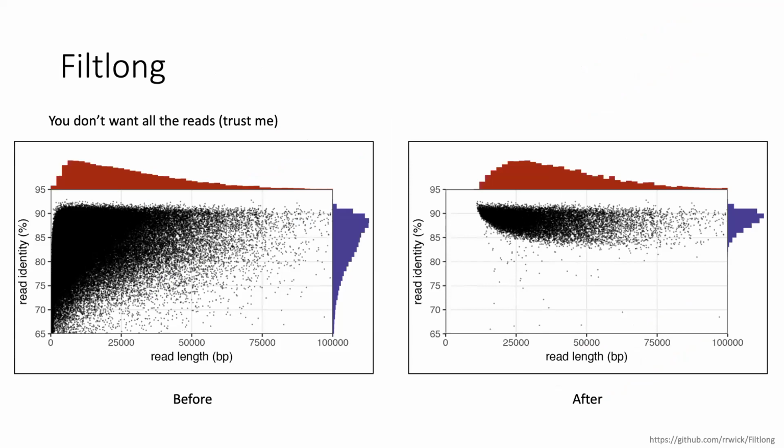So this is a tool, it's called Filtlong. There are many other tools out there, but Filtlong is really easy to use. And I'm going to walk through this graph. The left graph is before Filtlong. You can see it as a 2D graph.